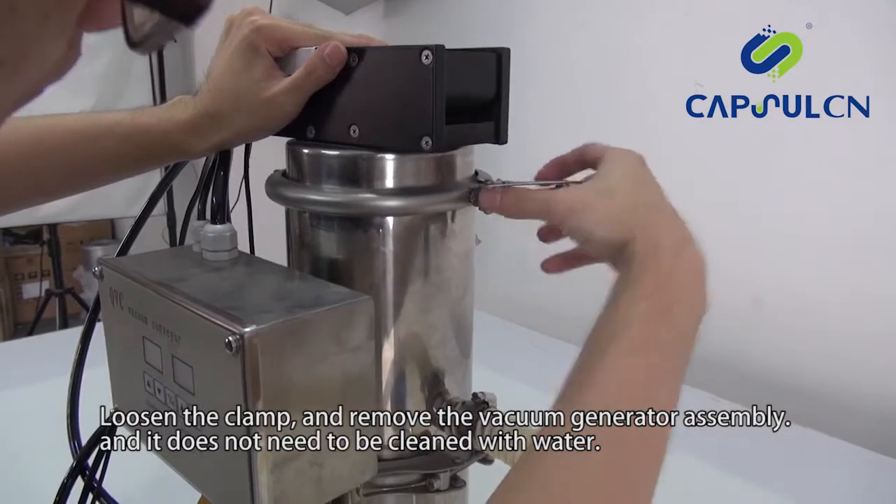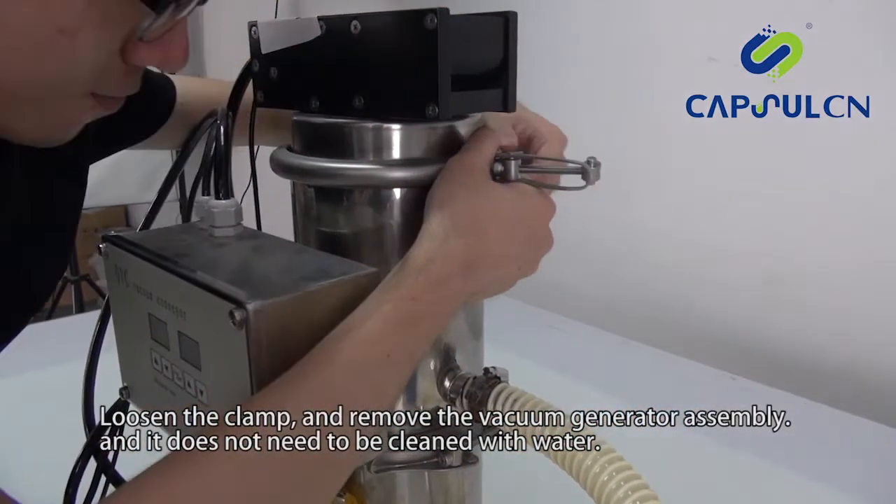Loosen the clamp and remove the vacuum generator assembly. It does not need to be cleaned with water.